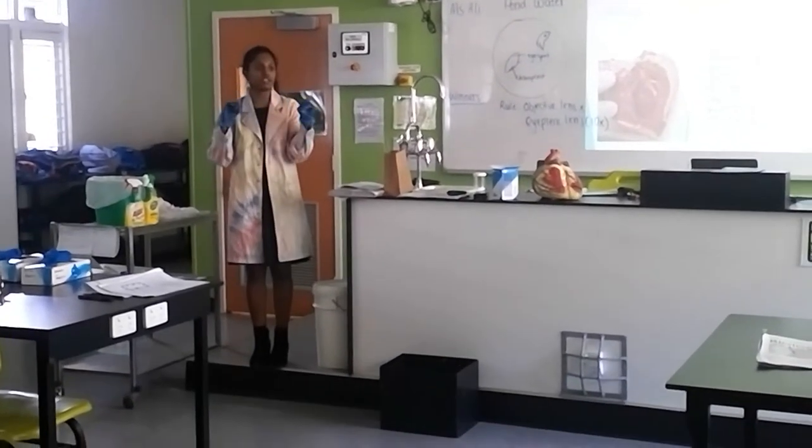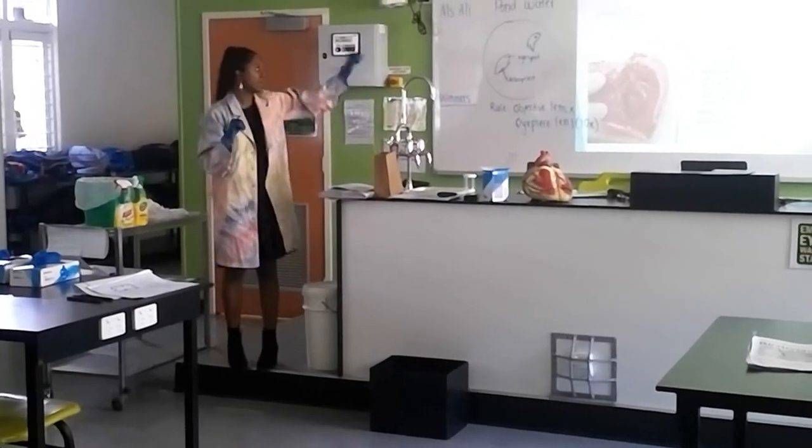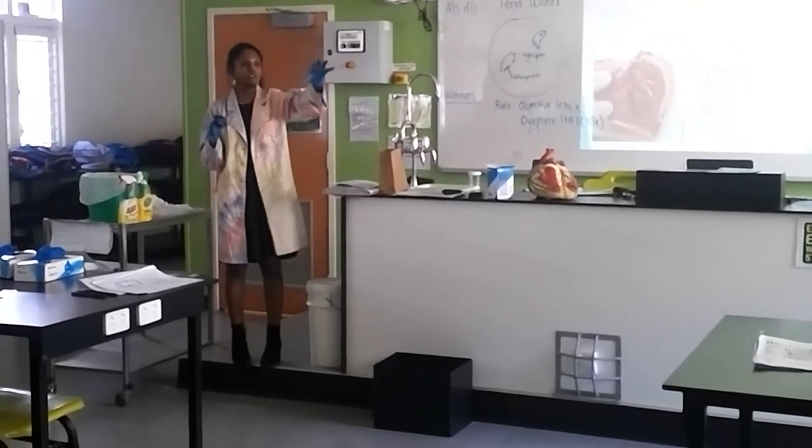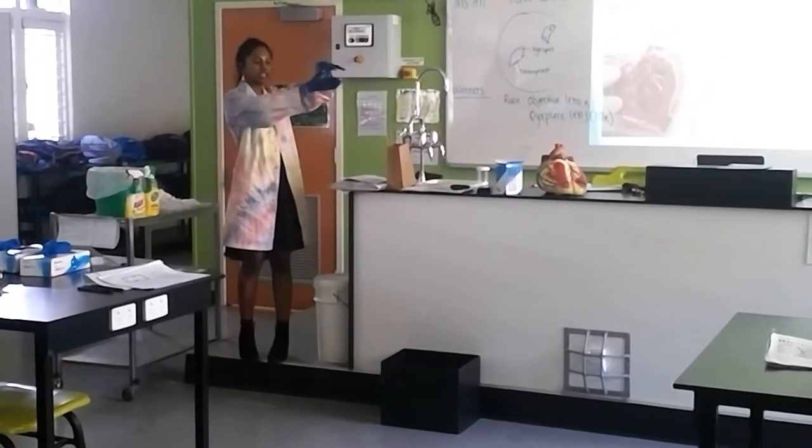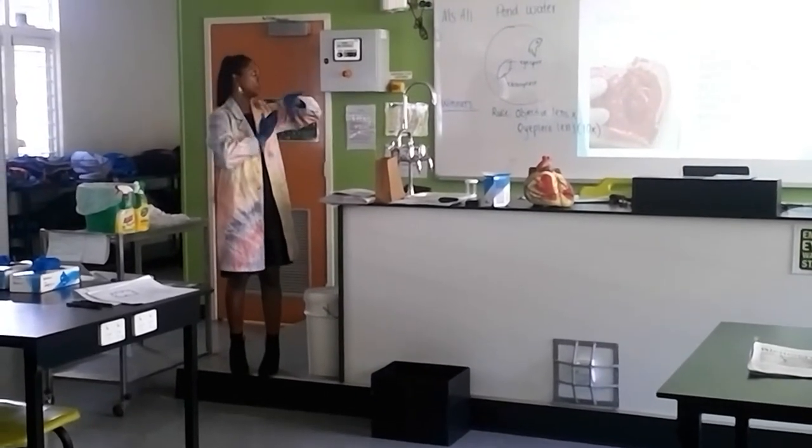Once you've got that, I want you to open it. You can use your probe, you can use your tweezers, and see if you can identify your left atrium, which is at the top, your left ventricle, which is at the bottom, and that bicuspid valve that separates them. It's in the middle.